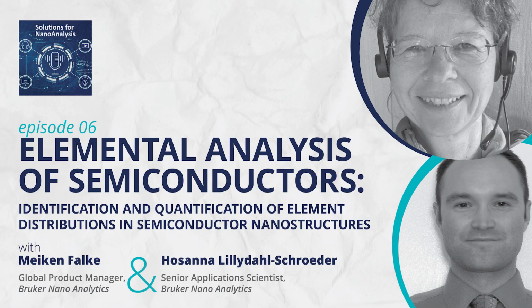Then there are people who say, oh, we use just imaging. The dark field contrast tells us where something is heavy and where something is lighter. But this also fails for 3-5 semiconductors and also for the mixture of elements, which I mentioned before. Because as soon as you have more than one heavy and more than one light element mixed, it's difficult to judge just from the image where is which element. So for this, EDS is really ideal. It can use energy ranges of up to 80 keV, which is really difficult to do easily and quickly for EELS. Yeah, and as an aside with EELS, don't you also have issues with deconvolution with that technique as well?